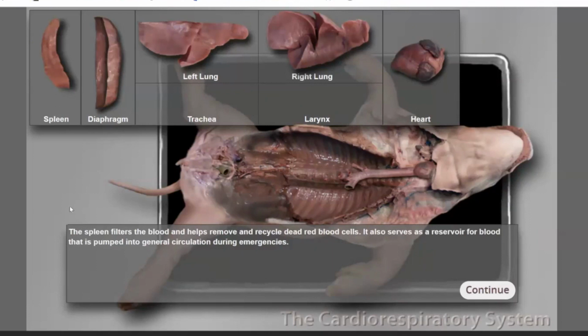So that means your spleen has a huge blood supply. In one disease called mono, if you've known somebody who's had mono, or if you've had mono yourself, if you get mono and you go to the doctor, they're going to push on your belly a lot. The reason is because they want to see if your spleen is enlarged. If your spleen swells up, they can feel that by pressing on your abdomen.